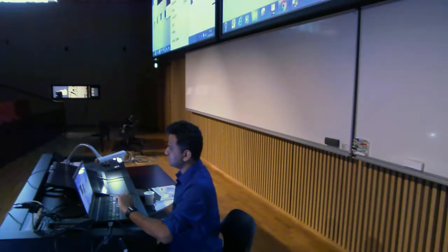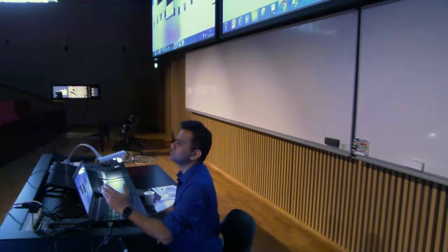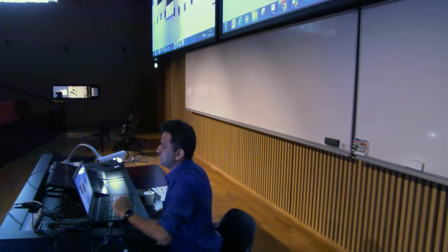What will happen is that whatever is the region of interest, that will be black. I don't know when you have to do it, but that is possible. It is also possible to clear outside. So all the pixels which are outside this window will be blackened. Okay, and then you can only see the region. Maybe it is good for presentation. One must not do it in publication, yeah, but just to visualize.